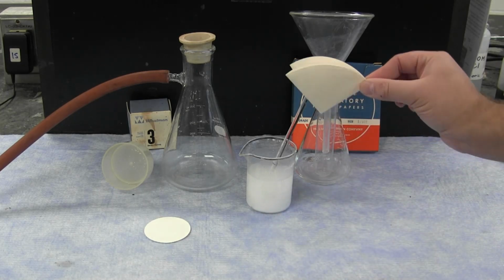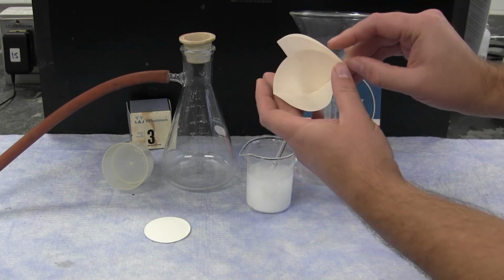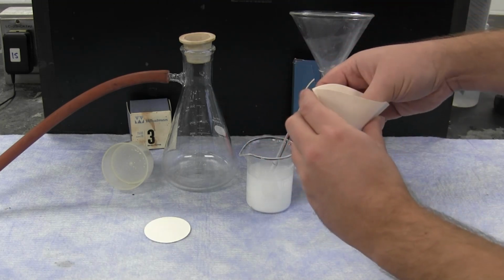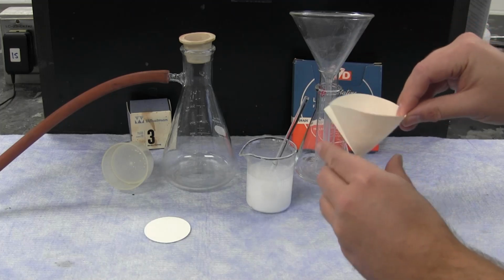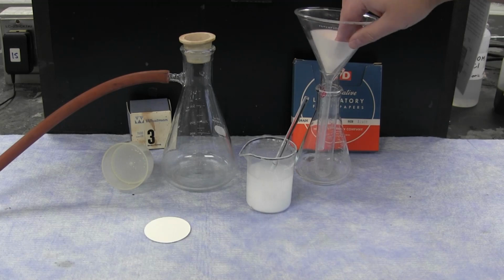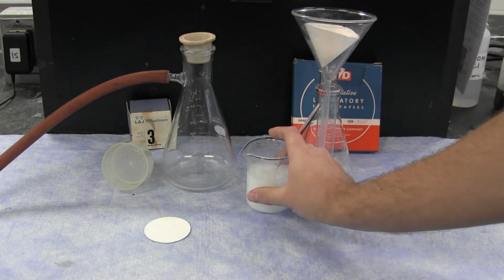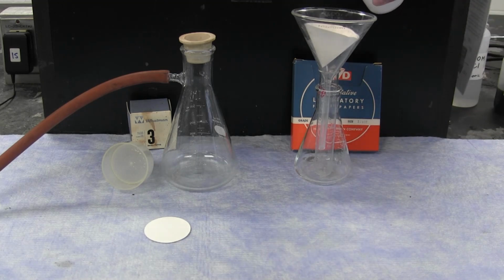What this ends up making is two separate lobes which could be opened up into a paper funnel. This paper funnel is then placed into a regular funnel, and the solution that needs filtration is passed through it.